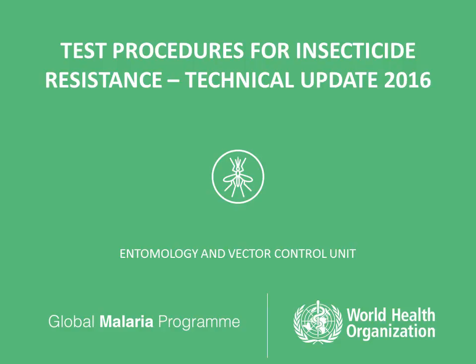What I'm going to present are recent updates in the test procedures for insecticide resistance monitoring in malaria vector mosquitoes. This work was developed by the Entomology and Vector Control Unit of the Global Malaria Programme here at the WHO, and it was published online in November 2016 on our website.